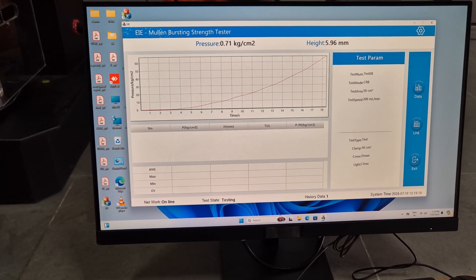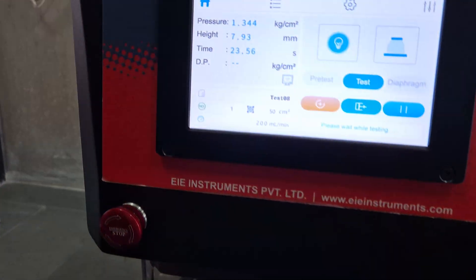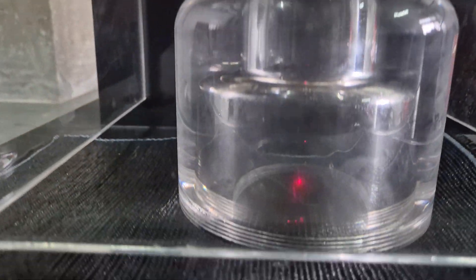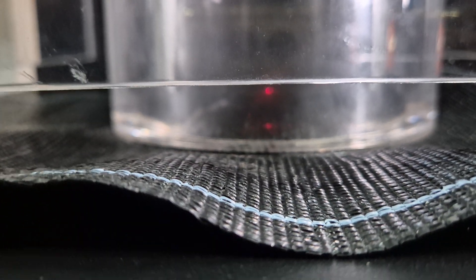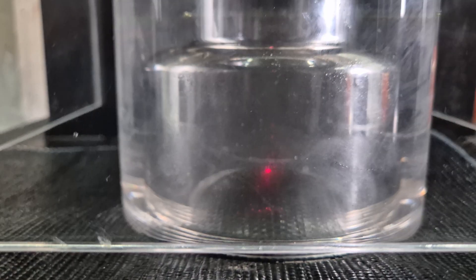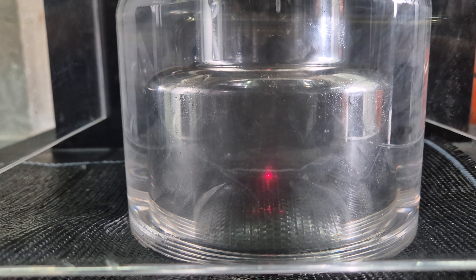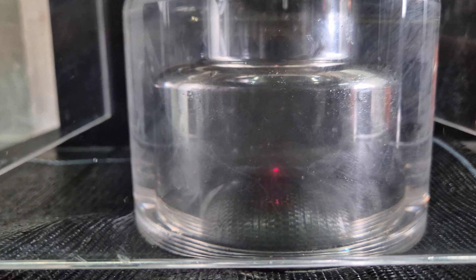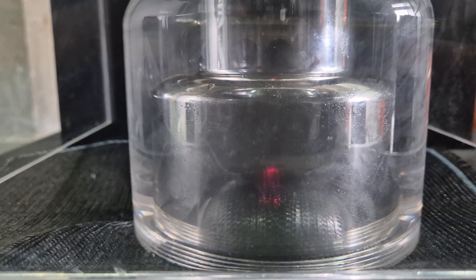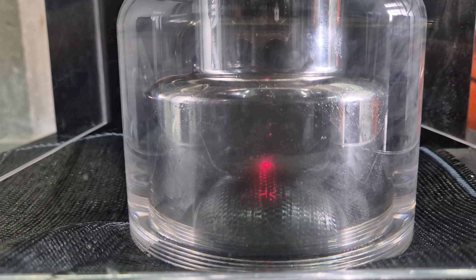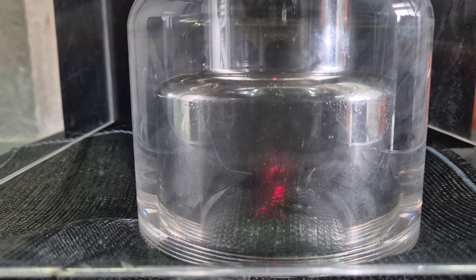The test runs — slow and normal — and then performs. Now the sample got burst.